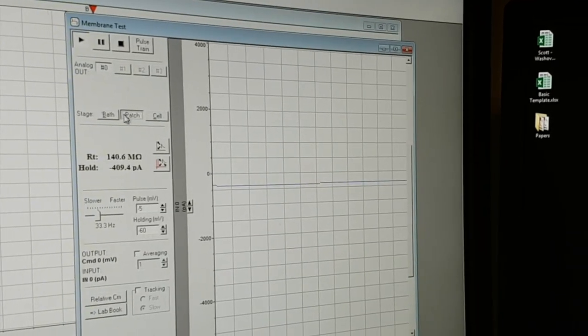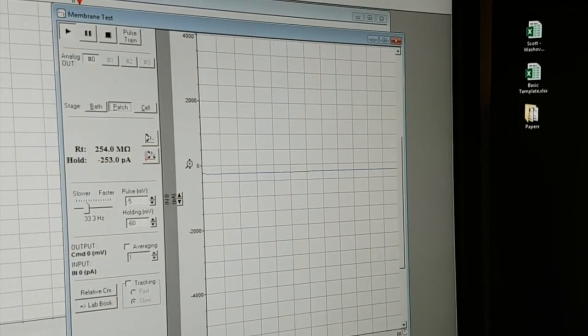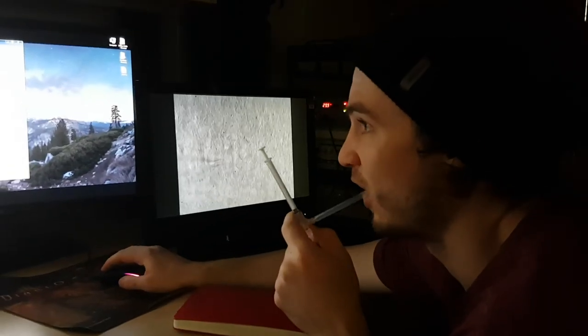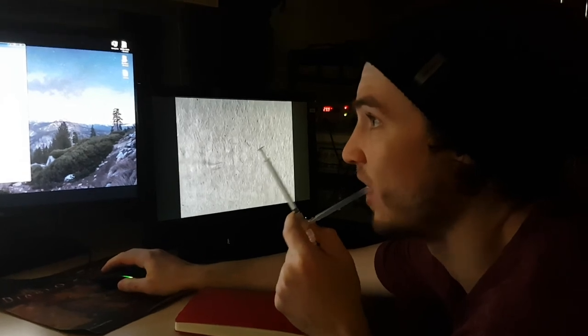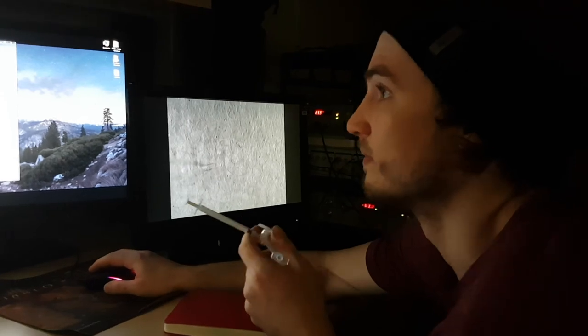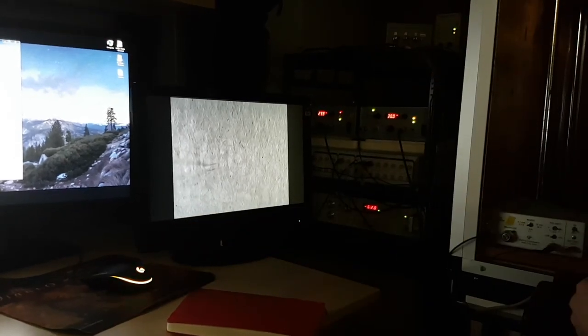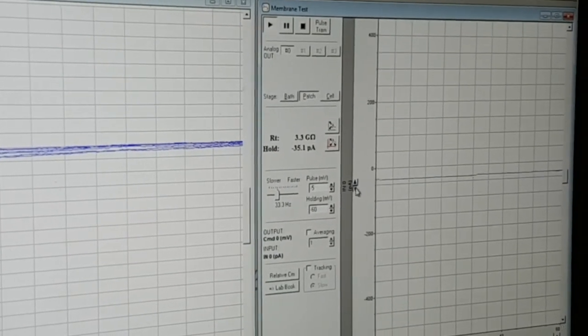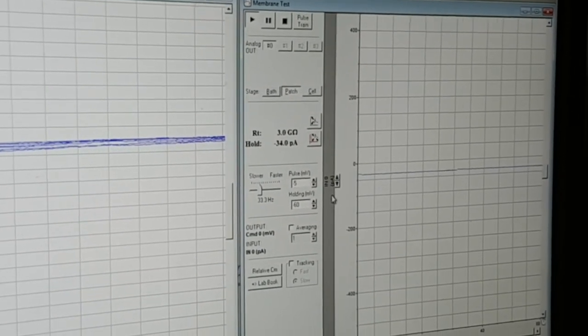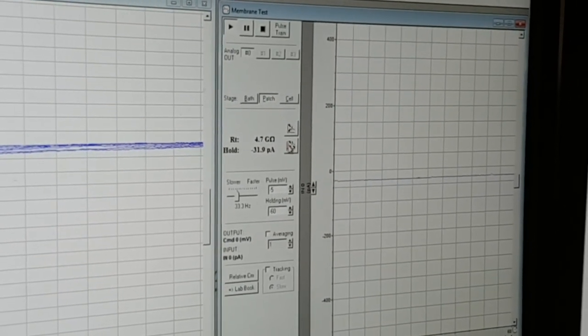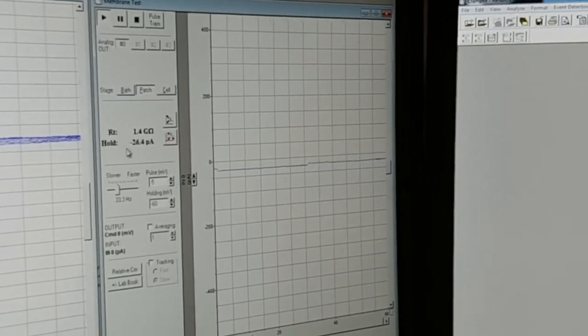Once we have adequate pipette tips, and we bring the pipette tip into contact with the cell membrane, we can see that the tip resistance increases to roughly 200 mega-ohms. By then applying a slight negative pressure, we can create the giga-ohm seal, with yet an even higher tip resistance. This is because the gap between the membrane and the tip is minimized. As with the giga-ohm seal, we will see this square pulse of current greatly diminished, even further. And this is because less current can pass through the tip of the recording electrode.